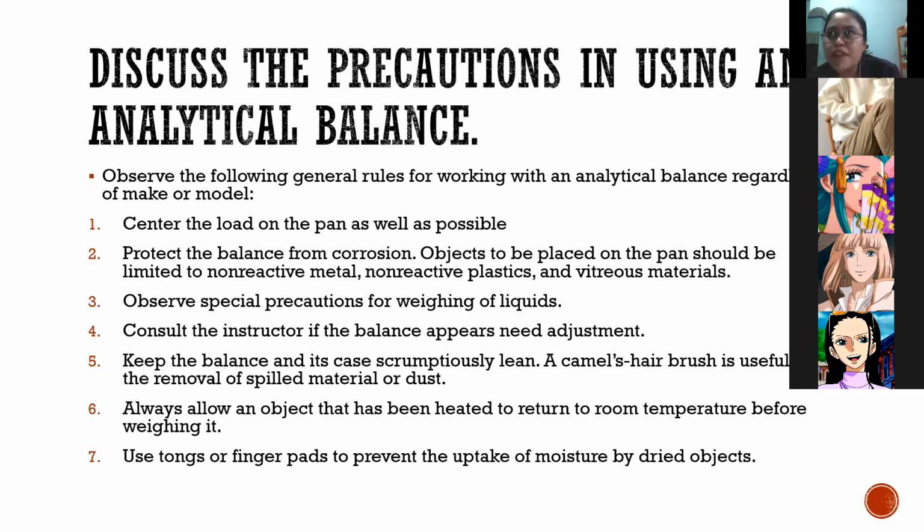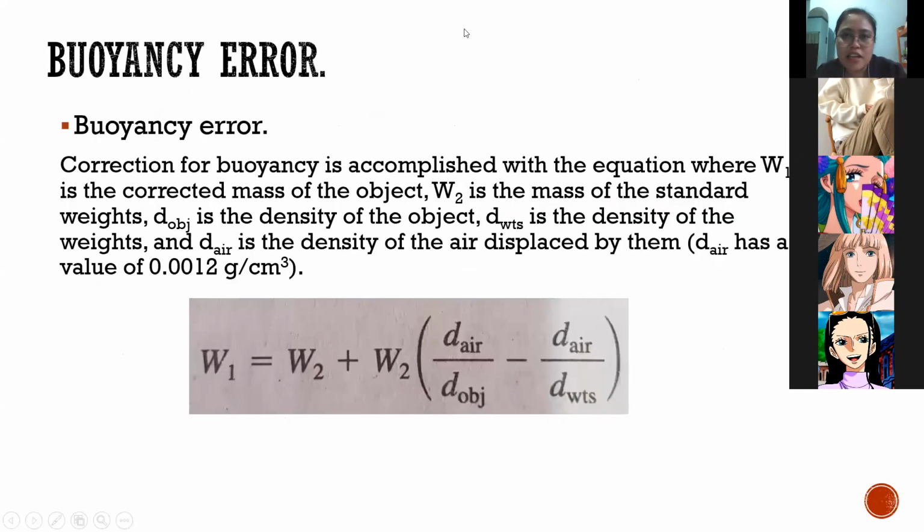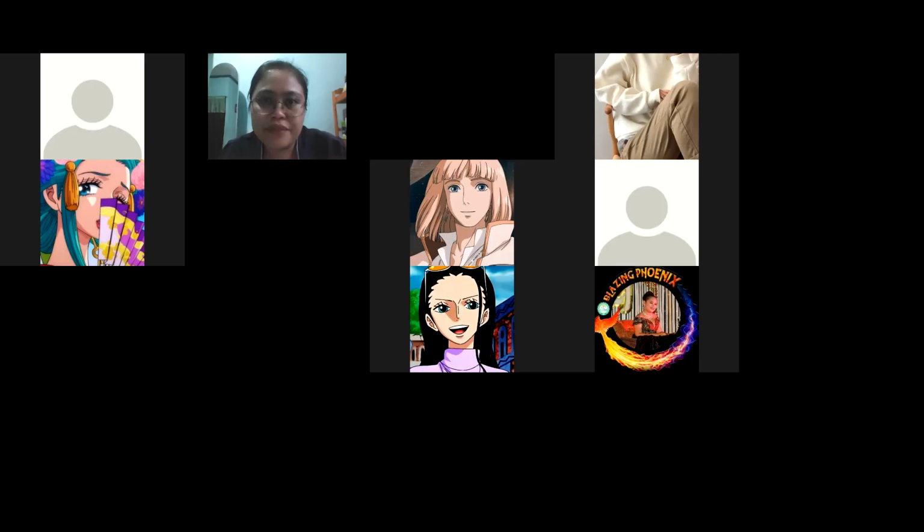It can be a source of contamination, and our hands have oil. So if we hold it, it will react with our material and add to the measurement. Okay? So this one is just the addition to what group 1 reported. Questions?